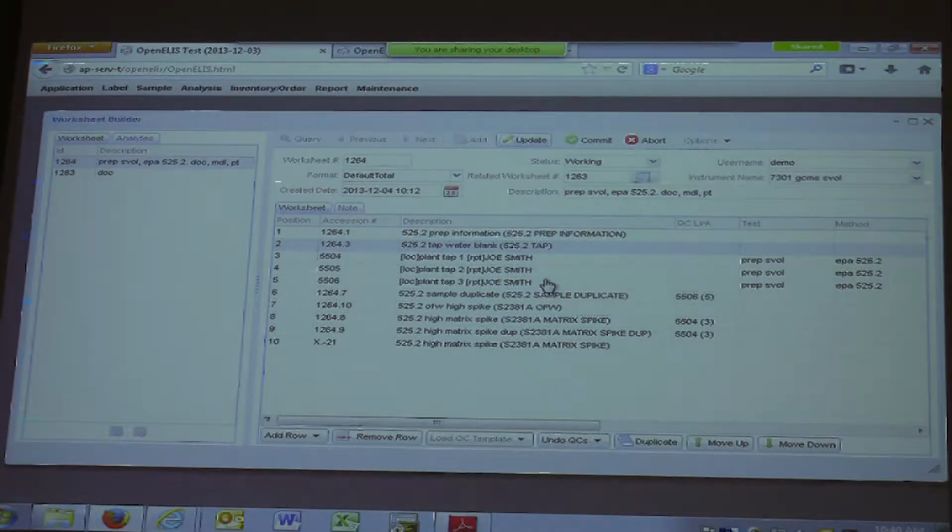Well, won't that also be important when we get the interface? It's more difficult to realize that 1264.3 is in position 2 than if it were numbered .2 when you're renaming things for interface purposes. It will come into play with the interfaces, depending on how a particular interface is written or the way the lookup is done in the interface.